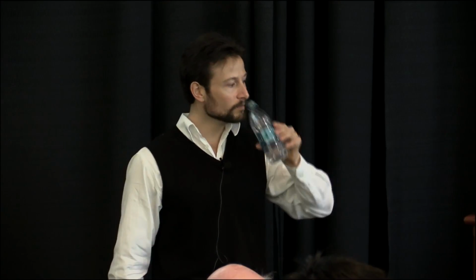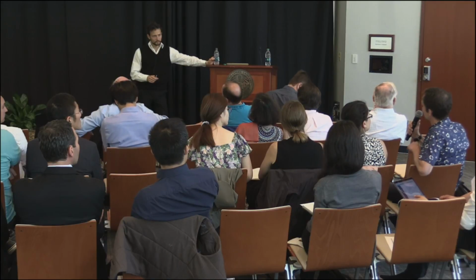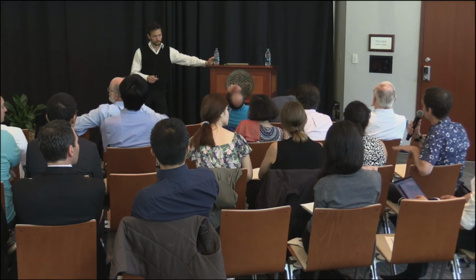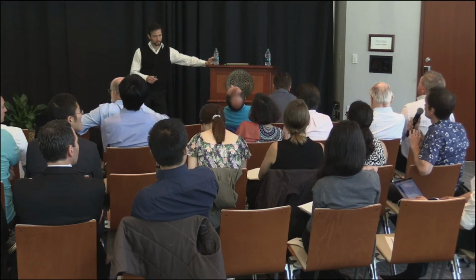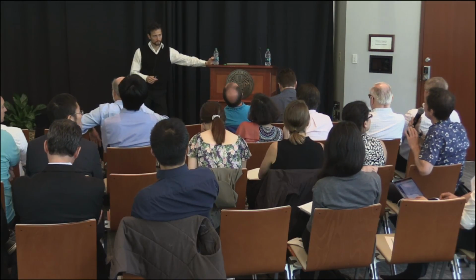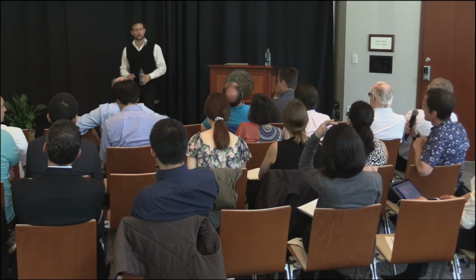Thank you, nice talk. So my question is basically cell biology oriented, since you are working with mitotically active cells that might be in different stages of a cell cycle. I would like to ask if you would expect to see different proteomic profiles of cells in different stages of a cell cycle if you synchronize the cells somehow. So the question is, is there any footprint of the different stages of the cell cycle in your data?